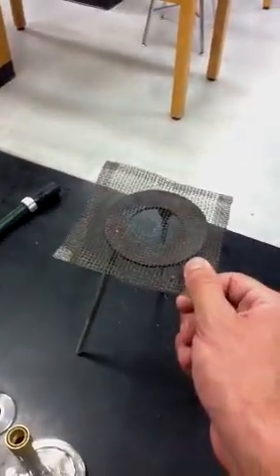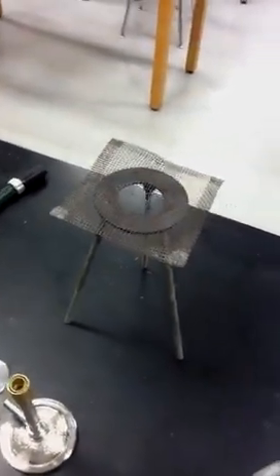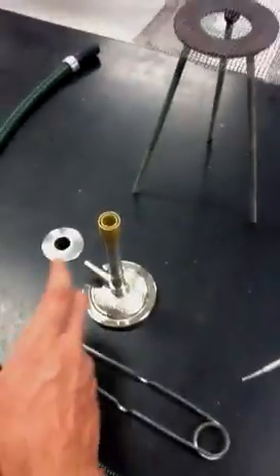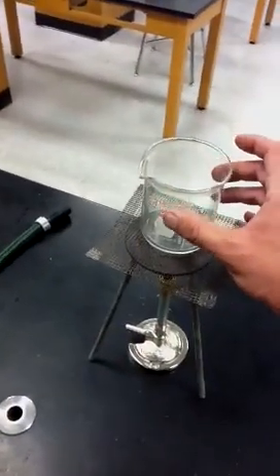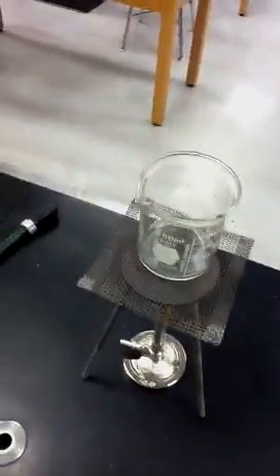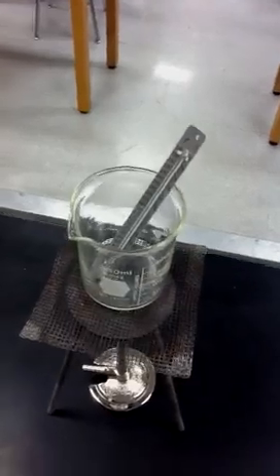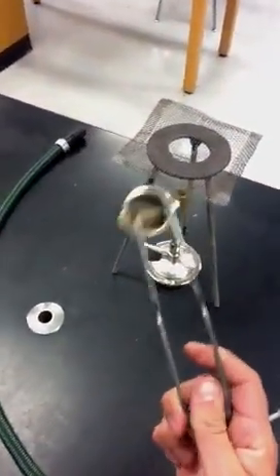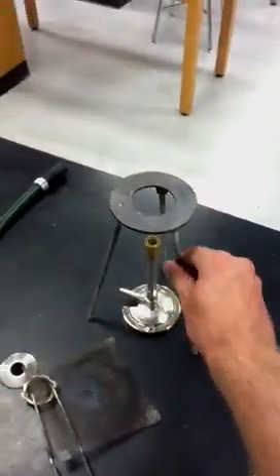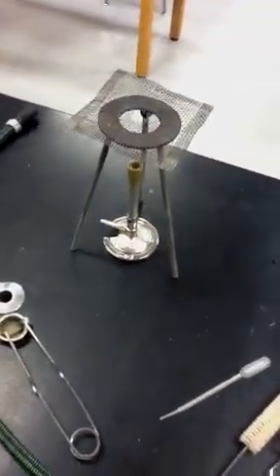This thing here is called a tripod. And this is called a wire mesh. You may be wondering what it's used for — sometimes you want to heat things up, so you have the Bunsen burner underneath hooked up to the gas line, then a beaker on top with the flame going up and heating the liquid. That's when you can put your thermometer in to check the temperature and even stir it with a stirring rod. Let's recap the Bunsen burner items: the Bunsen burner, the hose, the striker, the wire mesh, and the tripod. Now would be a good time to review these before we go on to the last group.